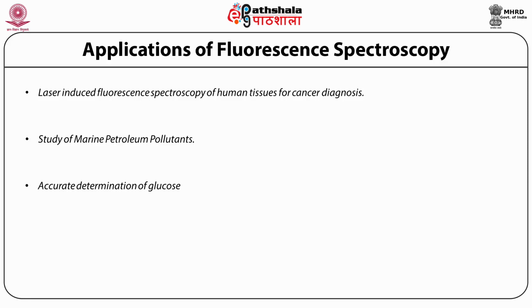Also, fluorescence spectroscopy is used to study biological structure and functions. Here, the fluorescence spectrum is highly sensitive to the biochemical environment of the fluorophore, and fluorophores have been designed such that their spectra change as a function of the concentration of metabolites such as pH and calcium.